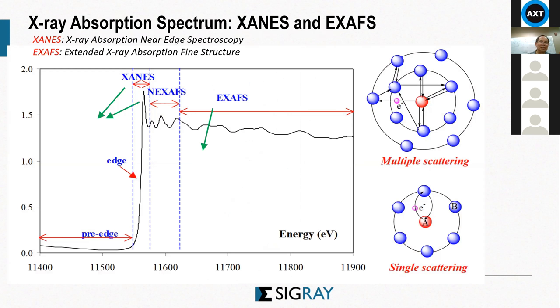On the next slide, you will see the near edge and EXAFS. This one is particular to around 11 keV, and you can see the terminology there: XAFS, near edge XAFS and EXAFS. Typically the horizontal axis is X-ray energy, and the vertical is how much you attenuate by the atom of interest. In the near edge you get oxidation state, for example, iron two plus or three plus, and the far edge EXAFS region gives you interatomic distance, bonding and local structure, essentially local coordination number: how many nearby atoms in the first shell and the second shell you can get from the EXAFS spectrum.